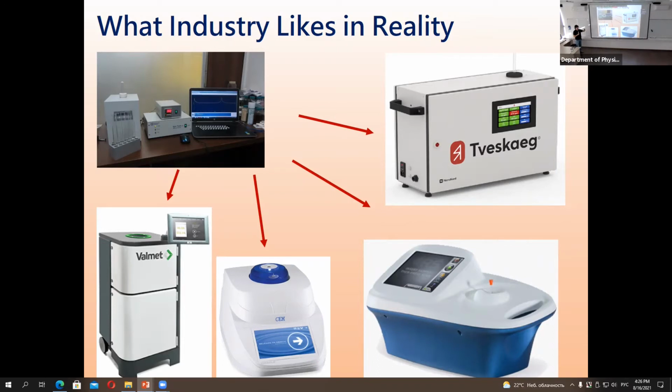The spiral coil produces the radio frequency field, but I think you have seen that the lady was putting it quite deep. So just outside, if you put there a special device that can measure this radiation, you can get it. But you know the duration of a pulse is a few microseconds. So it normally doesn't bring any problems.